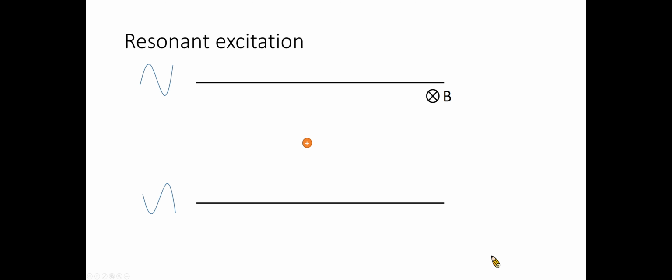The small cyclotron radii mean that ions do not ever travel closely to the surrounding detection plate, therefore inducing very little image current. Likewise, the random distribution of ions around the central axis means that on average, the image current of any one ion will be offset by the image current of an ion on the opposite side of the axis.